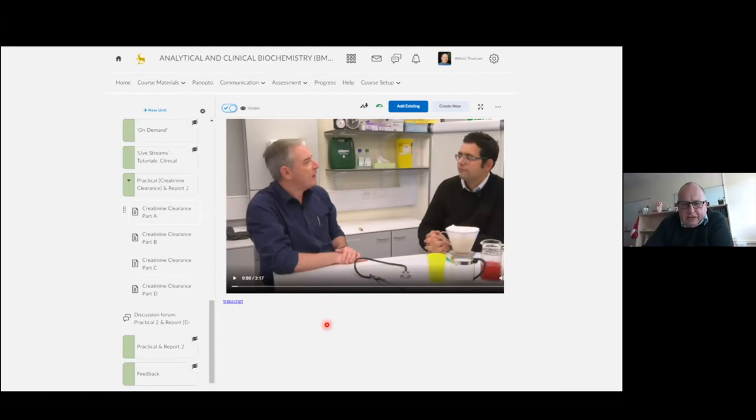In terms of the actual online practical, this is the second practical we got from the Open University. This is on creatinine clearance. Again, seamless integration with our VLE. There are four parts to this practical. Parts A and B are two different videos that explain the physiology, not in depth, but enough so that the students know what's going on. Then in part C, they do an age-related experiment, and in part D, it's different health conditions.